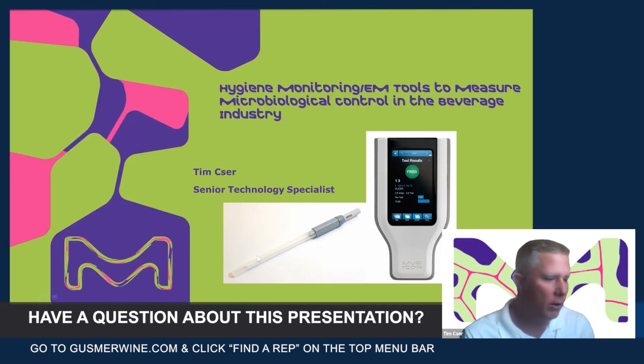And now we want to go over hygiene testing. And I think I'm on track. I think so. Yeah, this will be pretty quick. So we have the MVP icon that's used for hygiene testing. And you guys are probably familiar with this. It's ATP testing, hygiene testing. So next slide.